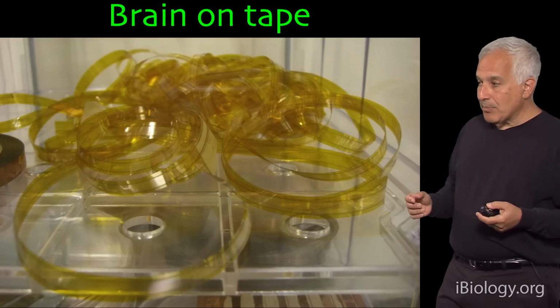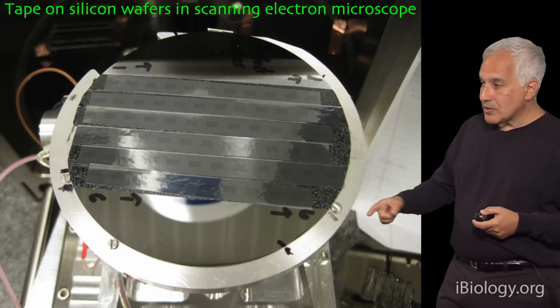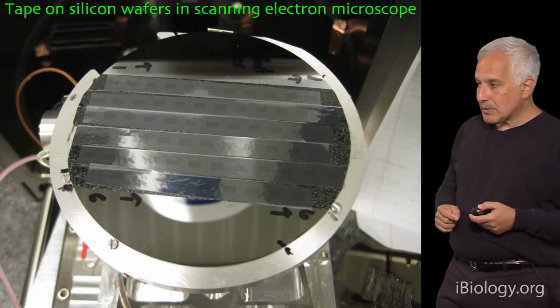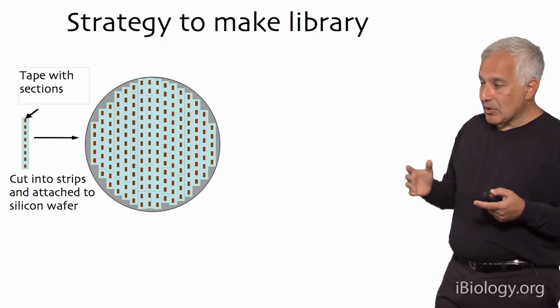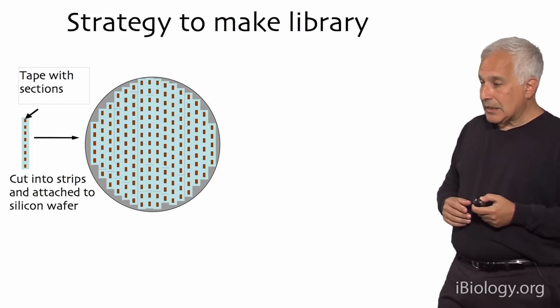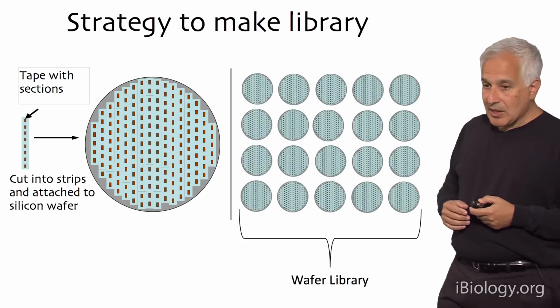And then we cut the tape up into strips and put the strips on a flat silicon wafer. You can see the sections on the wafer. And then image it in the electron microscope. Now, to generate a whole brain or a large piece of brain, one has to make a whole library of sections like this. And this is the idea here. One makes a library by taking the strips, putting them on a silicon wafer. This idea of a library was one of Ken Hayworth's ideas when he built this in the first place. And one wafer after another, you just keep going until you have the entire brain on wafers.